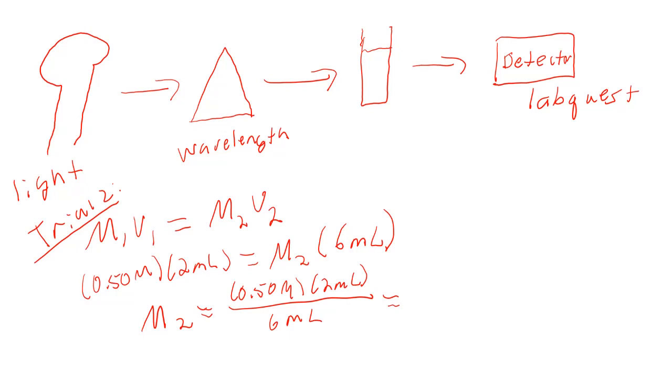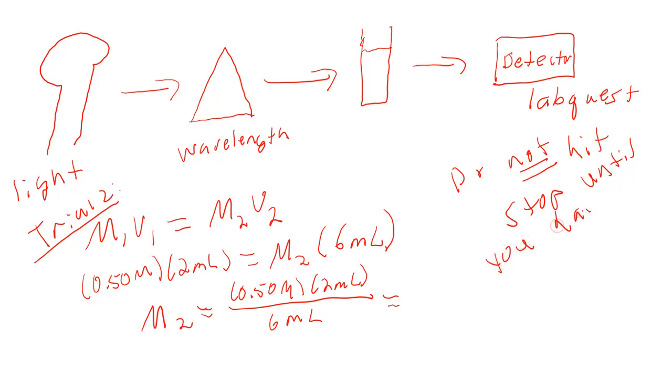Then when you do your different solutions, when you start the data collection, only tap keep. Do not hit stop. If you hit stop, then what's going to happen is it's not going to give you a graph. You don't hit stop until you've done all of your solutions. Until you have done trials 1 through 5.